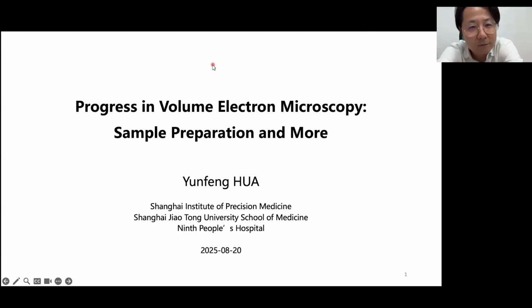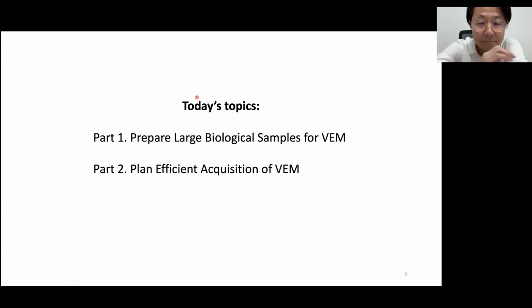As you will see, the title of today's talk will be Progress in Volume EM and Sample Preparation, and maybe a little bit more. My talk will focus on two parts. One is to prepare large biological samples for volume EM. The second is to plan efficient acquisition of volume EM.